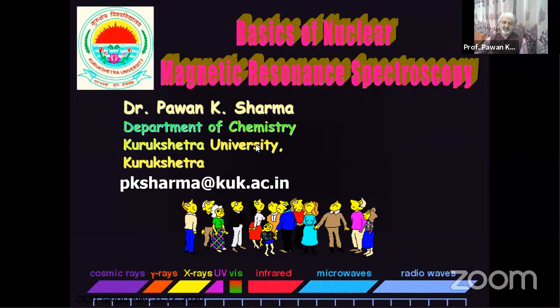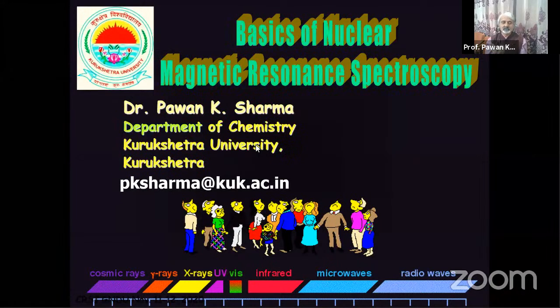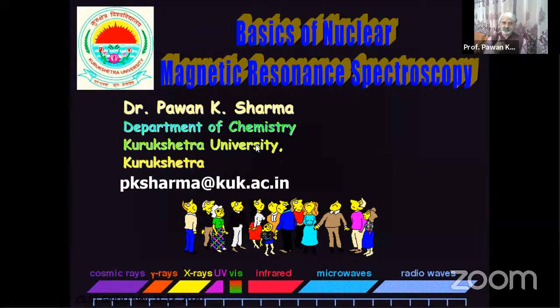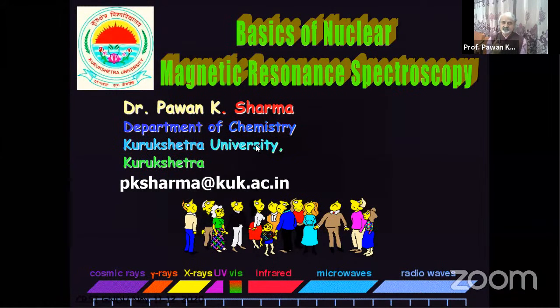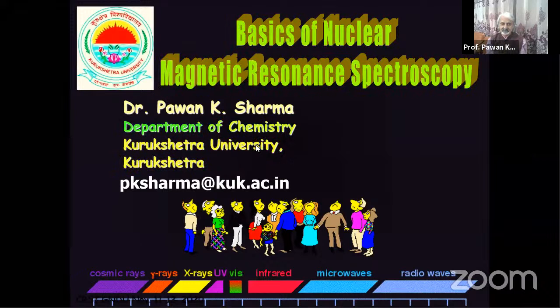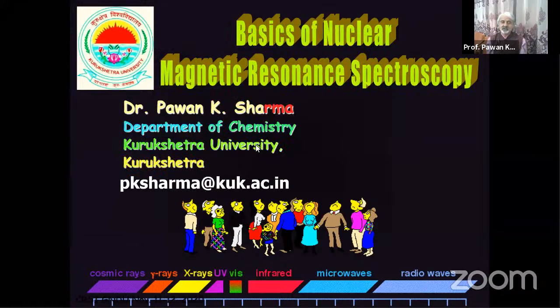I told you that for the understanding of NMR, whenever you put nuclei in an external magnetic field, we always take the direction of the applied magnetic field from the bottom to the top, and the electrons start to circulate under its influence. The circulating electrons generate their own magnetic field, what we call the induced magnetic field, whose direction would always be opposite in the middle.